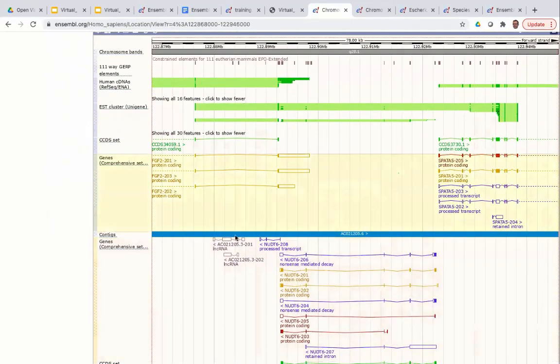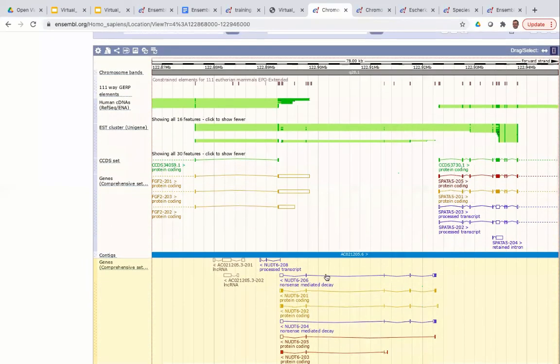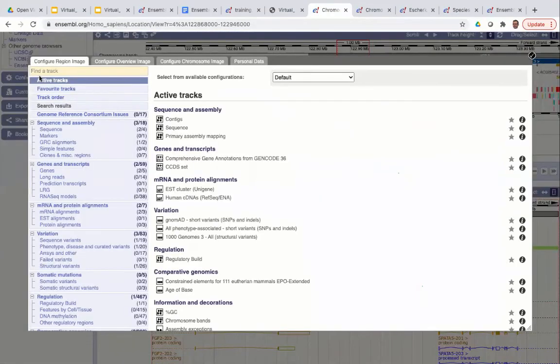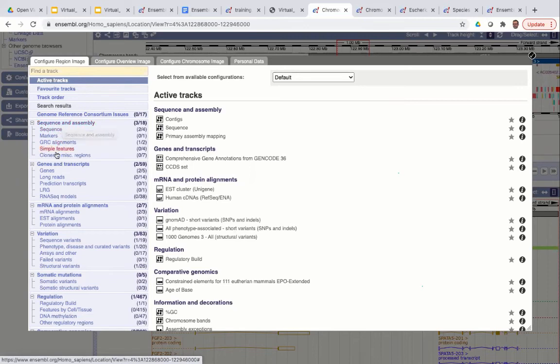The data shown in this view is what's displayed by default — just a small amount of what's available. If you click 'Configure this page', a pop-up window shows all the tracks you can add and manipulate. You can see the active tracks currently shown by default, and a menu on the left for finding all other available tracks. There are hundreds of tracks to view, so I'd advise spending some time in the exercises exploring which tracks show the data you're interested in.